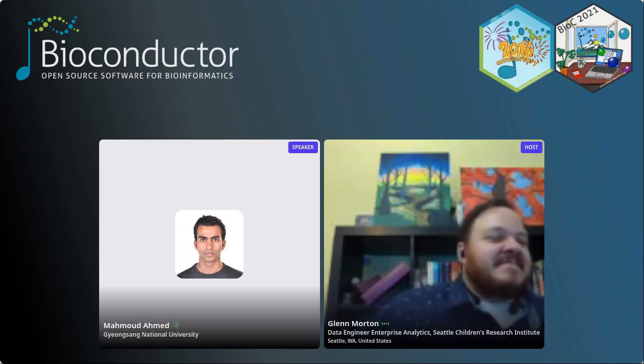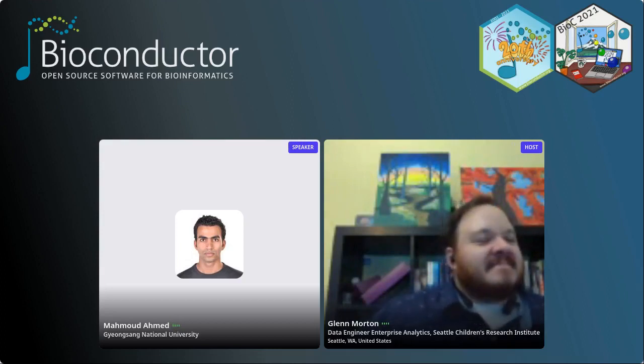Okay. So the idea here is that, well, I call it enrichment here using the nomenclature from ChromHMM, but it's really an overrepresentation. So they calculate the number of bases in a particular state and divide it by the number of bases in the annotation. So for example, if I'm calculating on CpG islands, I calculate the number of bases in each of these states, divide it by the number of bases in the feature, the CpG island, and then divide that by the number of bases in the annotation over the total genome. So just a simple overrepresentation.